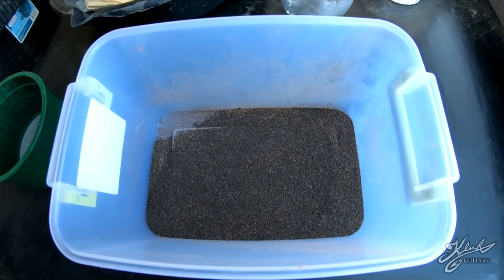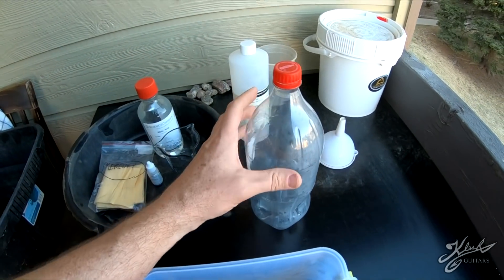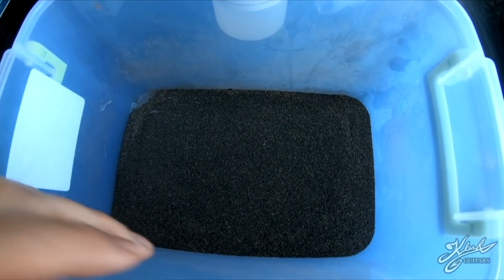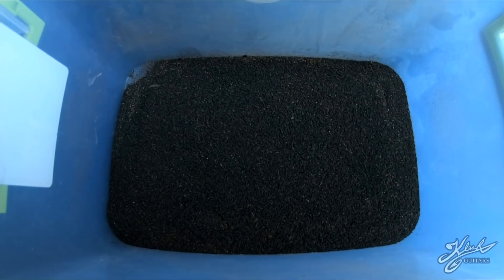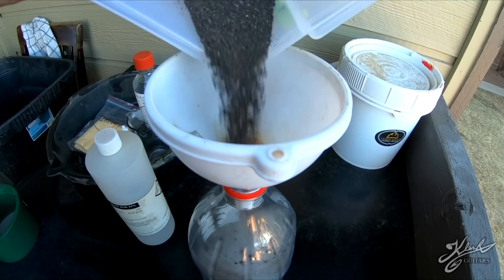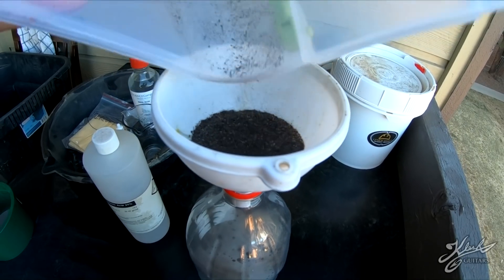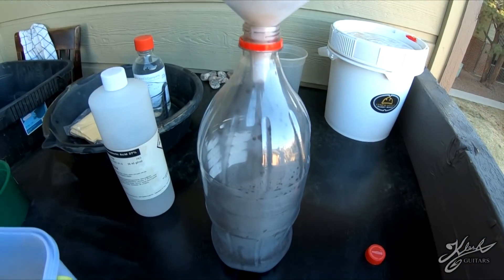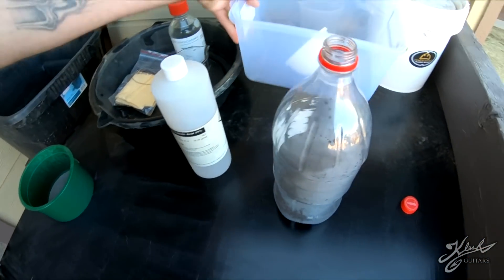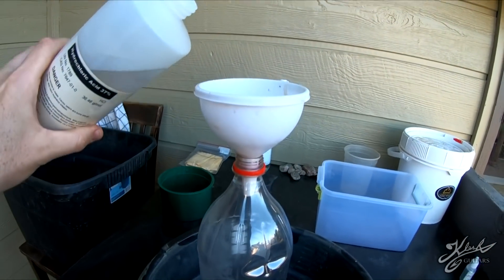So the first thing we're going to do is move this black sand into this coke bottle and we're going to add some hydrochloric acid. That is going to clean off all the black sand, which will allow the mercury to dissolve the gold. Now we're just going to add a bit of hydrochloric acid.